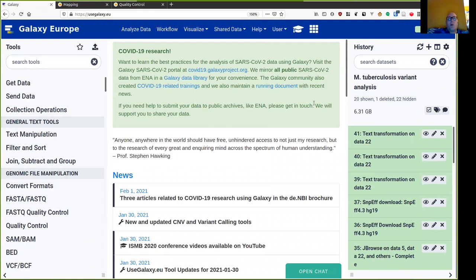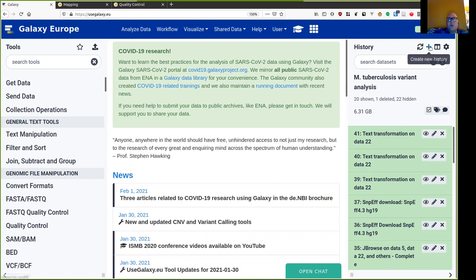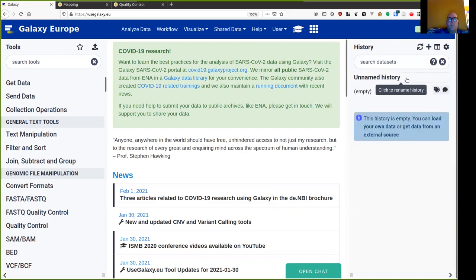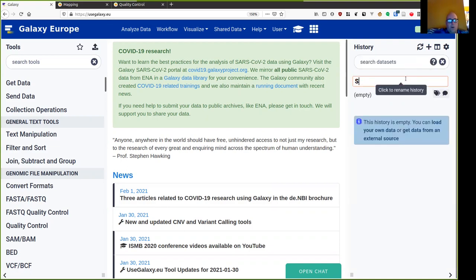For this tutorial, I will be working on the usegalaxy.eu server. I've used this server before, so I've got something in my history, but I want to start fresh, so I'm going to create a new history for myself and call it sequence mapping.